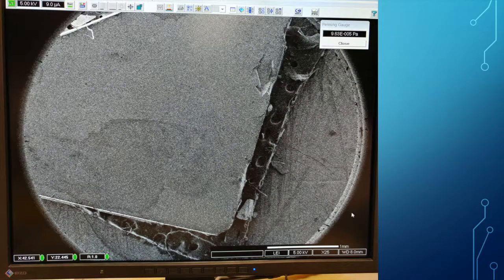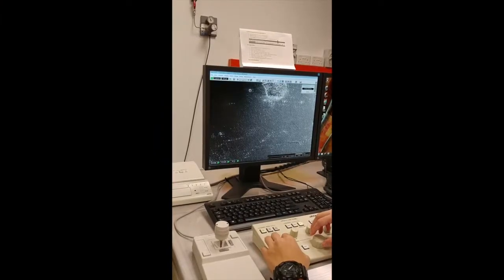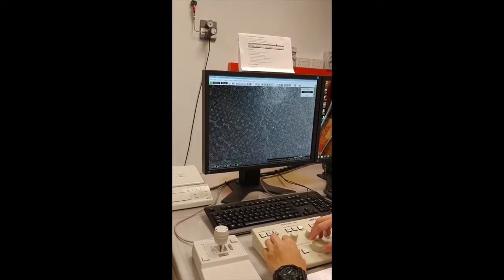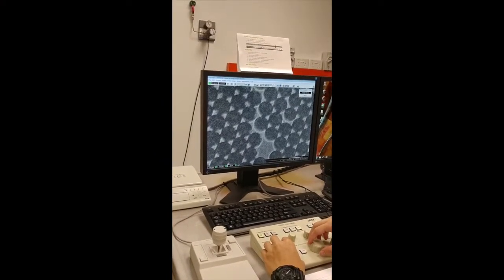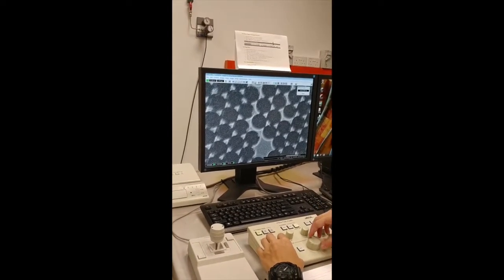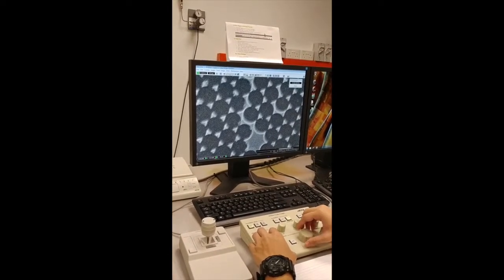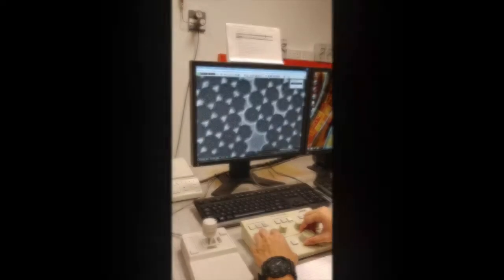After applying high vacuum, we could fine-tune the magnification of sample using the control panel mentioned earlier. But before we zoom in, it is advisable to locate the area containing the correct sample to be scanned using the low magnification, since it focuses on a larger area. Once selected, you can now see the operator slowly zooming in to focus on the nickel nanoparticles coated onto the sample plate. By using the various knobs that finely adjust the position of the sample stage on the X, Y, and Z axis, the operator can fine-tune the resolution of the image before the image is saved.